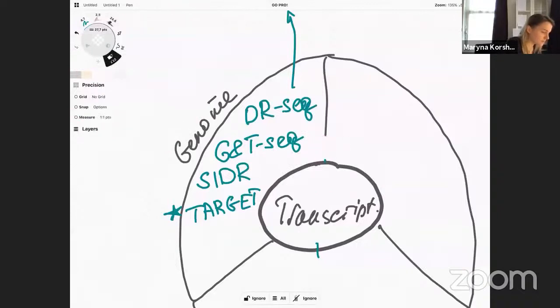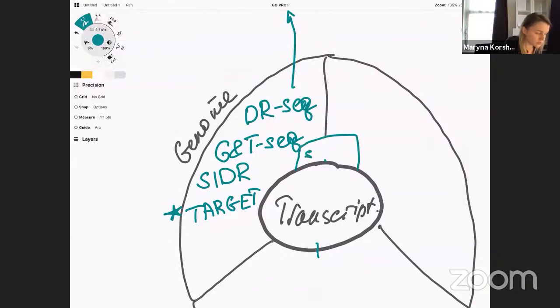Yes, so here on this border of genome, transcriptome and epigenome stands TriSEQ, the sequencing of three modalities. What's going on there is that you first separate your cells using FACS, then do cell lysis, then separate your DNA and RNA using a centrifuge.